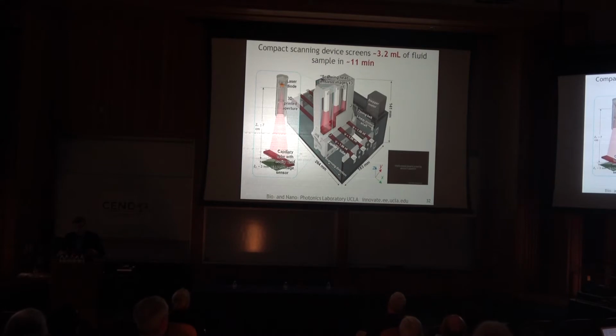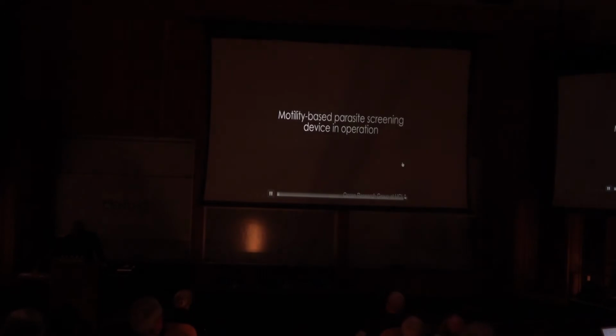The scanning time after all that 3 minutes of sample preparation is about 11 minutes with a device that has 3 different heads, each of which is looking at one of these capillaries. There's nothing magical about 3, but we're benefiting here from our cost effectiveness and compactness so that in a lightweight device, about 1.6 kilograms total, you can actually have 3 of these in a cost-effective manner being controlled in parallel. Here's a movie of how it's working.